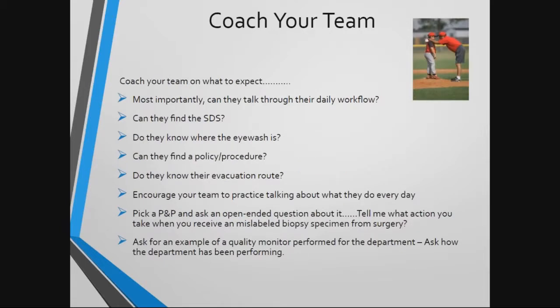In addition to the mock inspections, to help your team feel comfortable with the process, general coaching is also beneficial. We are getting away from the inspection teams that used to come in and talk to the leader only. Now inspection teams are coming in and interviewing the bench staff. They know the leaders know what is supposed to be happening. They want to know if the staff know. Share the checklists and the evidence of compliance with all staff. Make sure they spend time reviewing both the evidence of compliance and the checklists prior to inspection so that they're aware of the things that the inspectors will be looking for.